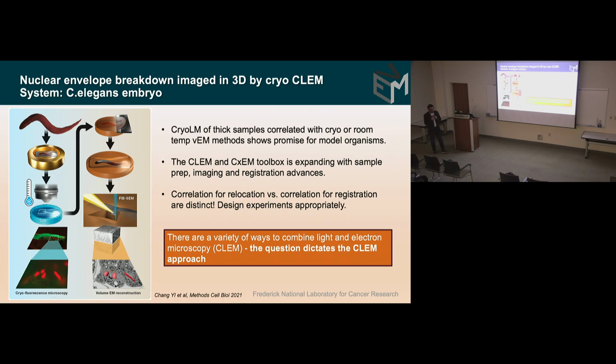the collaborations that we have done are correlation for relocation. Just tell me, hey, I just use the light microscopy like a flashlight, right? Now I know what zip code I need to go to, to find the needle in the haystack and collect my volume. Needle in the haystack.